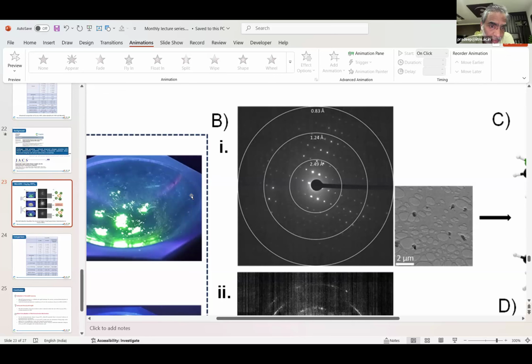Very nice. Why is it that certain intensities are lost, Anirban, on the right side of those two bright spots? We still have to figure that out, but yeah, these are certain details in these diffraction patterns from the data that you have collected.